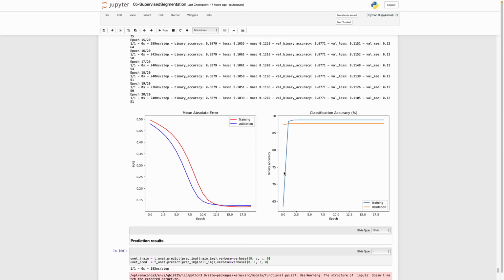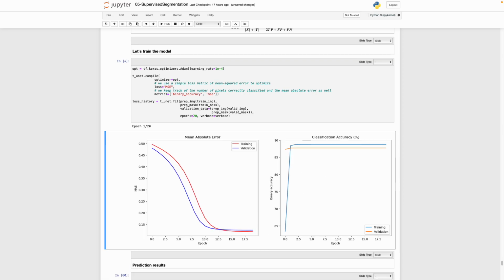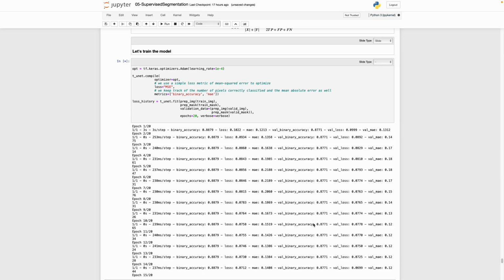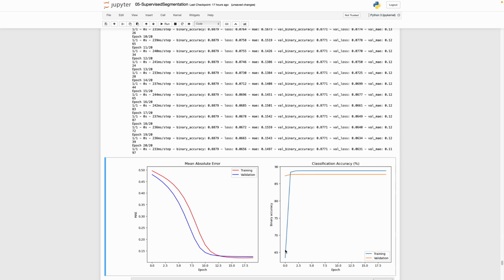So if I would do a new training here, that would be, in principle, training step 21 and forward. And then there should be some improvement, I believe. And at some point, it's overtrained, and then it starts doing too much, actually.